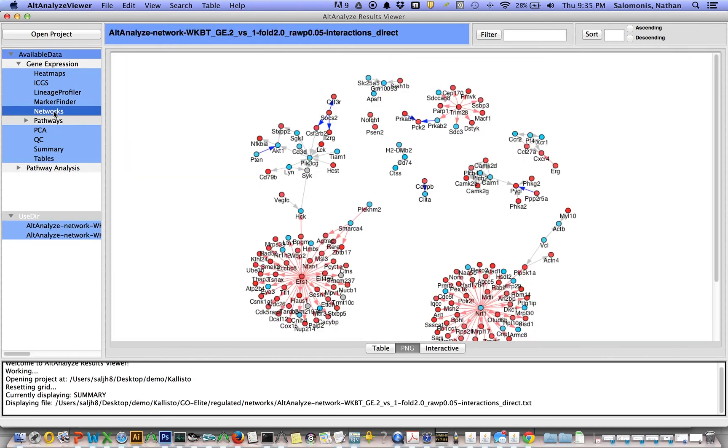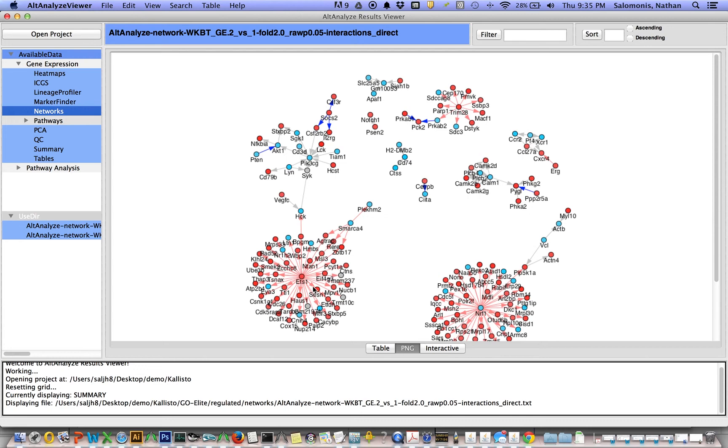These include networks of differentially expressed genes. Genes in red are upregulated. Genes in blue are downregulated. The red arrows here indicate predicted transcriptional targets. This is based on ChIP-seq data from a GoElite database that's present. The gray arrows indicate interactions from various different databases.